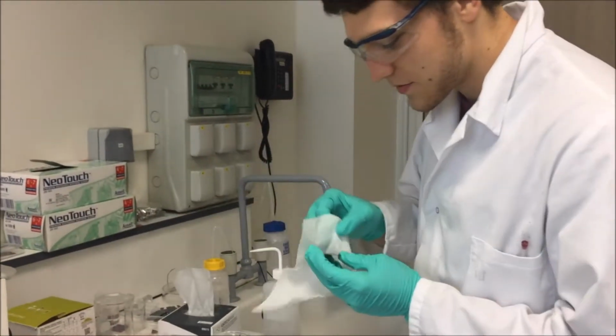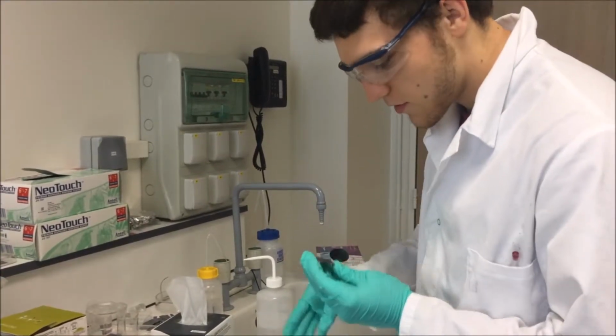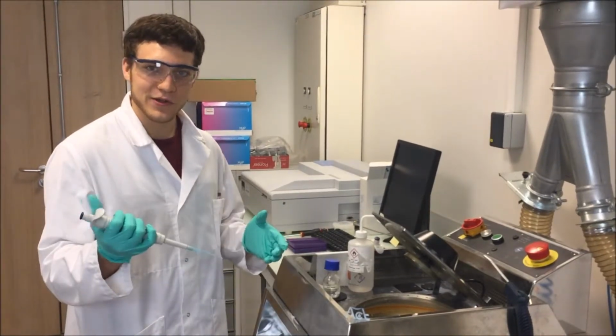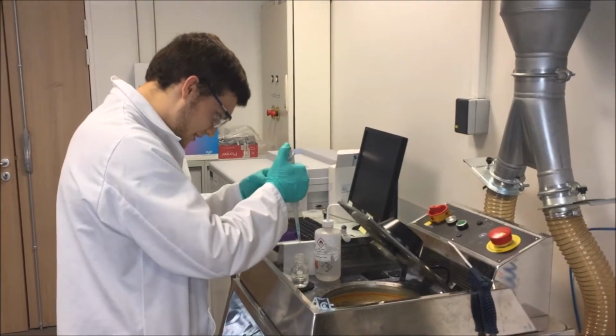I'm just going to go ahead again with this microfiber cloth. There we go. Nice and shiny. And now we're going to go ahead and spin coat it with some seed layer solution. So we're just going to dip our pipette in.